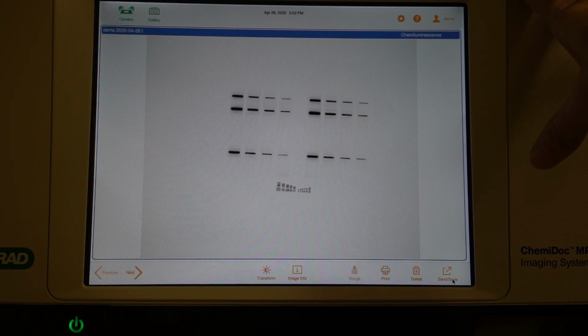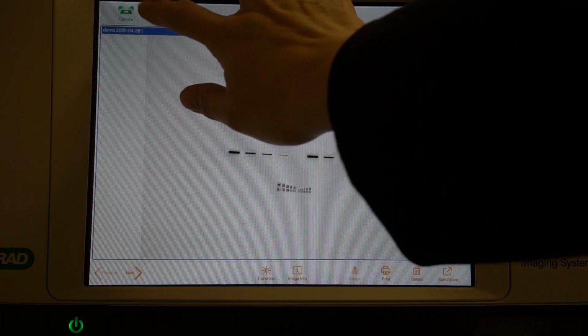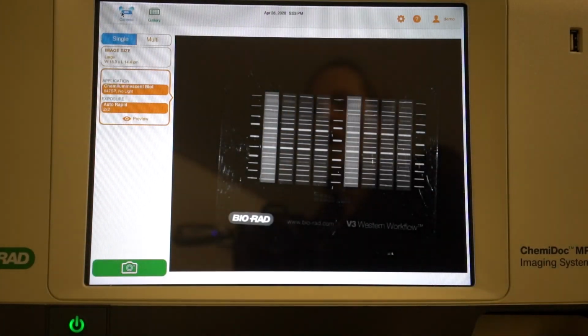So this imager also allows you to set up users and have authentication so that nobody can go in and delete someone else's files that are in their gallery. So you do have the ability to set up an admin and have user logons. So that is pretty much an overview of what we have here.